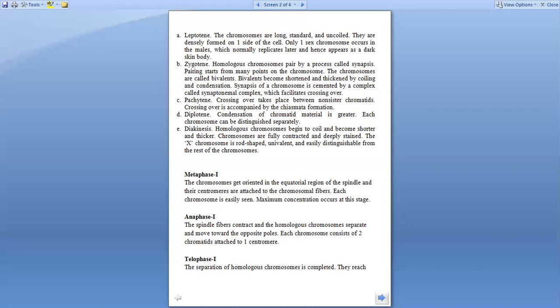After this is anaphase I, where the spindle fibers contract and the homologous chromosomes separate and move towards the opposite poles. Each consists of two chromatids attached to one centromere.